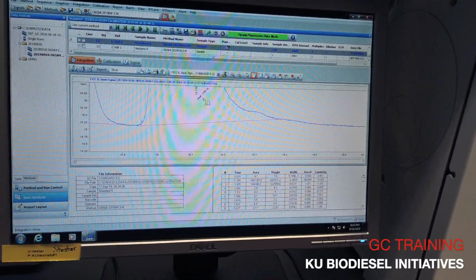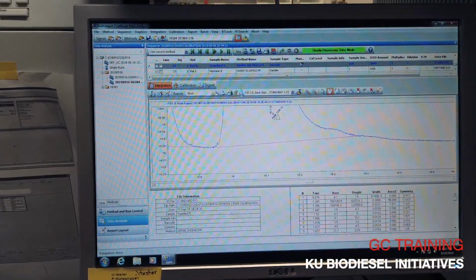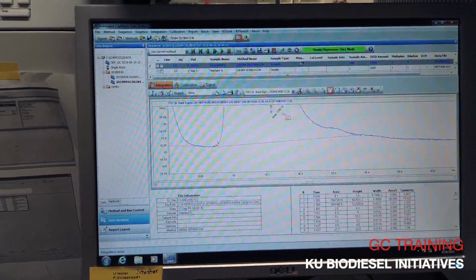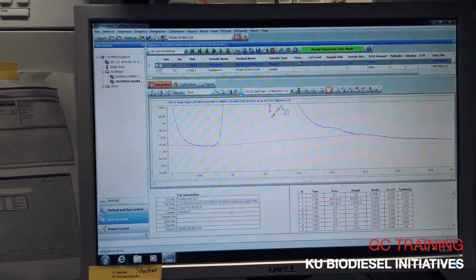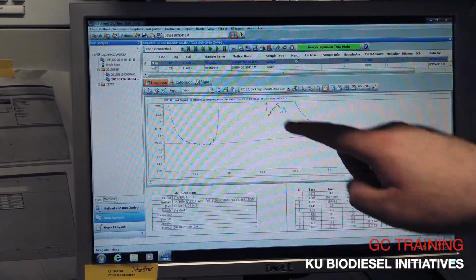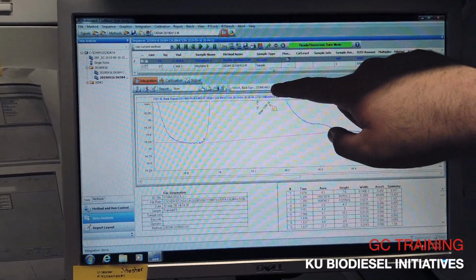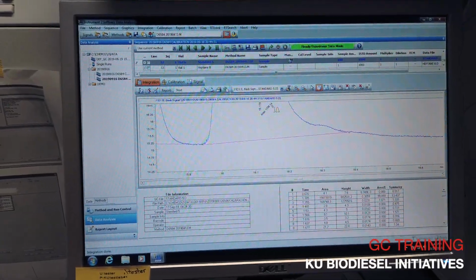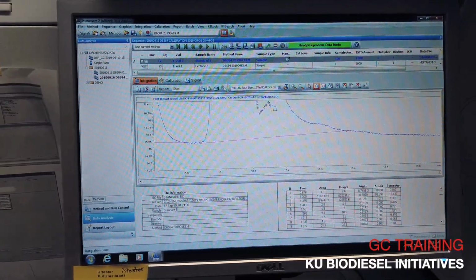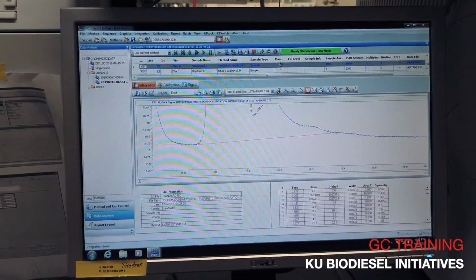So there's a couple places. This gives you the retention time. The retention time of this is 16.116, and then this is the area. If you do a manual integration, the area will be at a 45-degree angle, and if it's a regular area, then it'll be at the top next to the retention time. And then another place it'll be is here in this table.